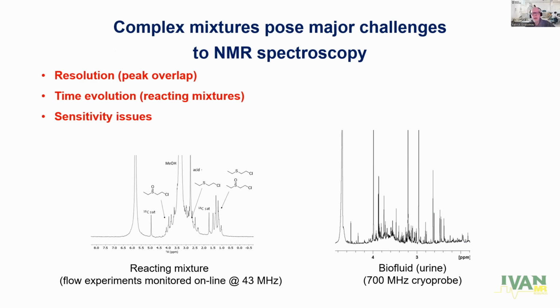And today we are going to deal more specifically with a different kind of complexity, which is the sensitivity issues of NMR. Of course, the sensitivity issue of NMR is general. It's not only for complex mixtures, but it becomes even more complicated for complex mixtures, which are generally constituted with molecules with very diverse concentrations, and analyzing complex mixtures is often trying to find a needle in a haystack from that point of view.